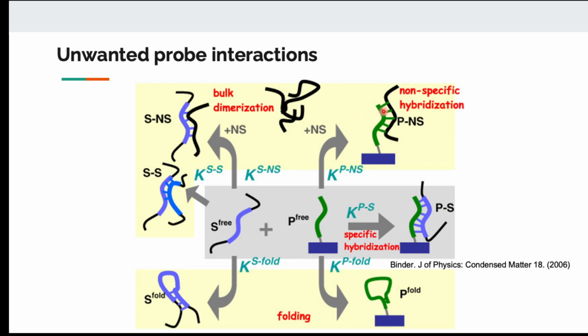The same goes for the microarray. If your oligonucleotide is not specific to a gene, it will also bind to other genes, maybe other fragments from the genome. So that can create a false positive signal. And sometimes your oligonucleotides can bind among themselves, if they have complementary DNA or RNA sequences.